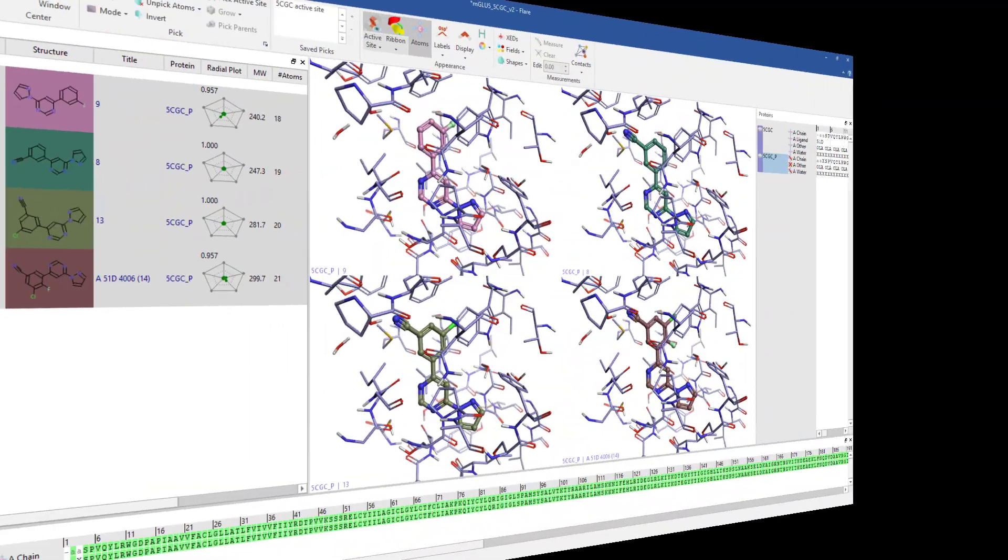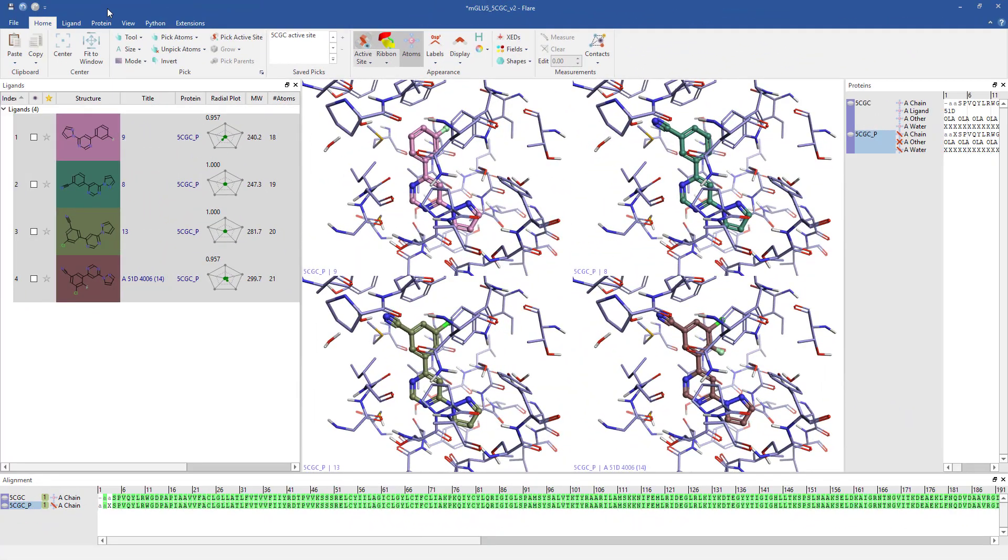As well as the visual maps, EC scores measuring how complementary a molecule is to its binding site can be rapidly calculated.